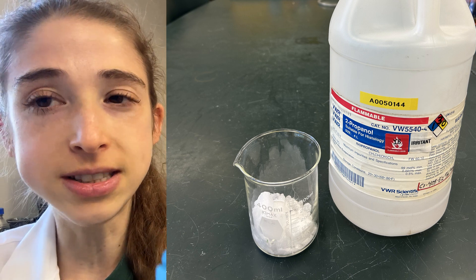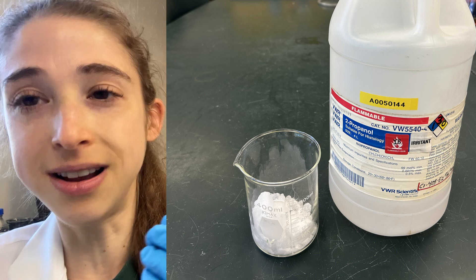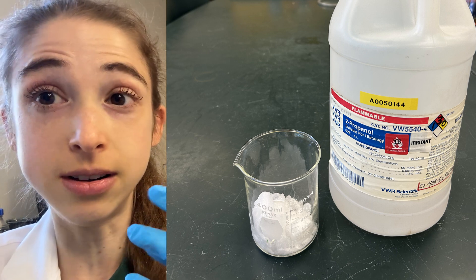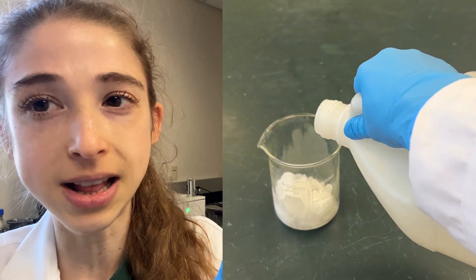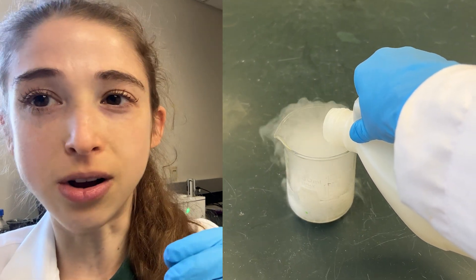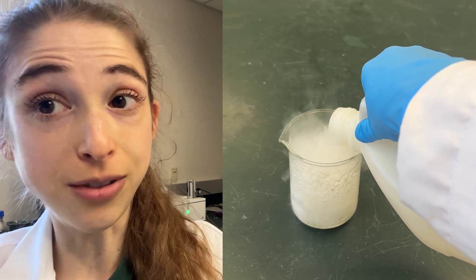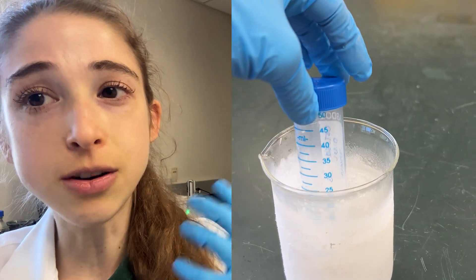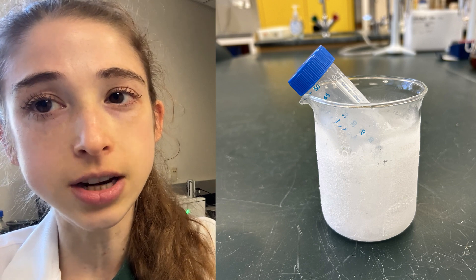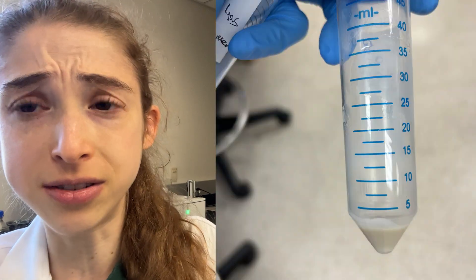If you just want to flash freeze some samples, take some container — make sure it's safe for really cold temperatures, so if it's glass make sure it's Pyrex or something similar, or use a plastic container. Stick in the dry ice, stick in the alcohol, stick your sample in, and voilà, you've got flash freezing. Remember it's not going to freeze quite as quickly as liquid nitrogen, but it's still better than nothing, way cheaper, and it's not just going to evaporate off on you right away.